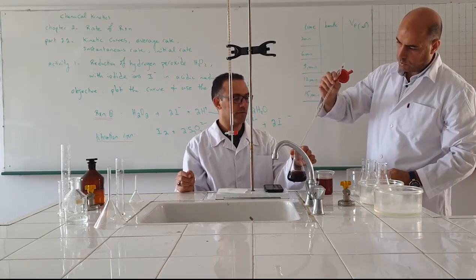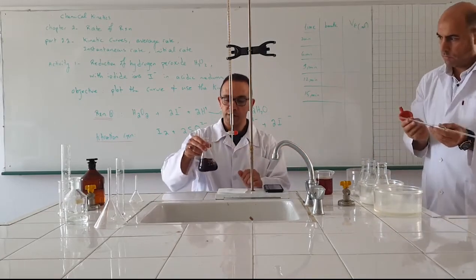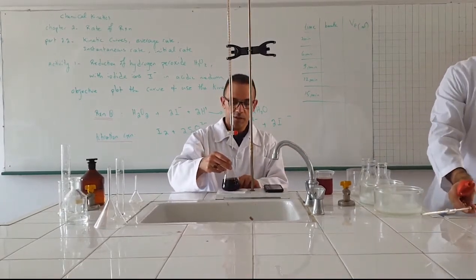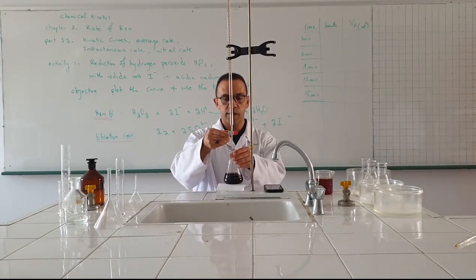The reaction is now blocked. Ice water, distilled water, blocks the reaction. Okay, start the titration with thiosulfate solution.